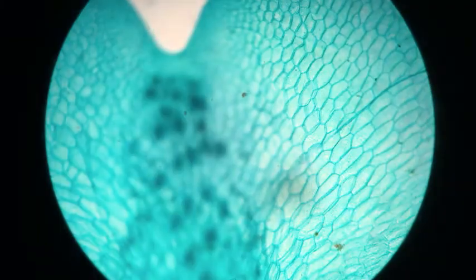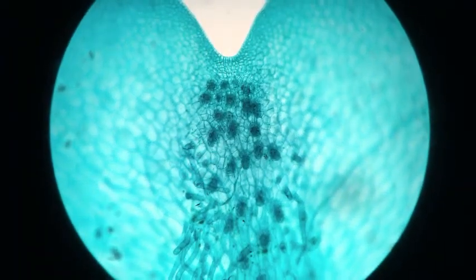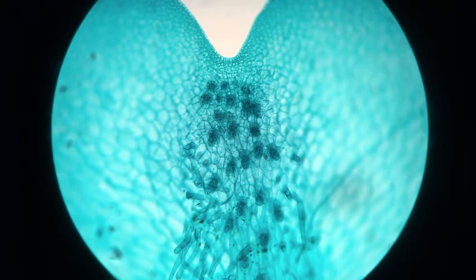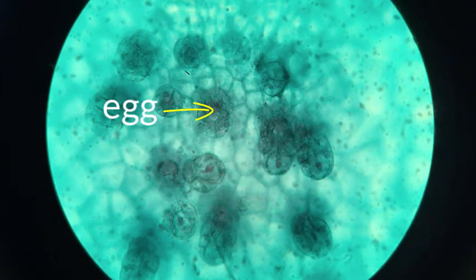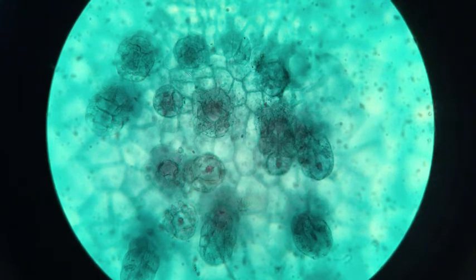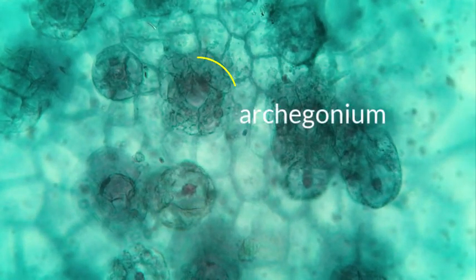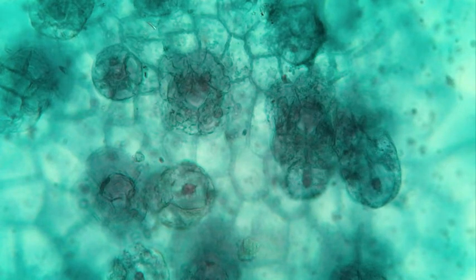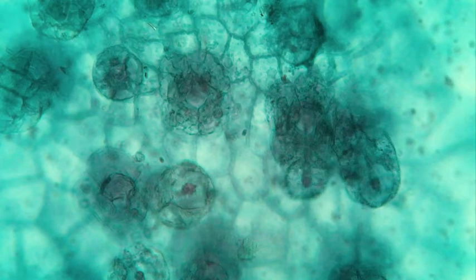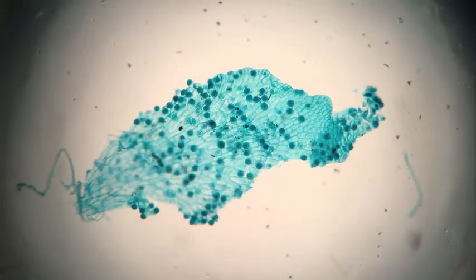When you zoom in on the dark spots you can actually see the difference. Not only are the antheridia more numerous, but the number of sperm cells contained in each anthridium is larger—in the dozens—while archegonia each have a central egg cell surrounded by other cells. Most ferns are homosporous, meaning 'same spores.' If a fern is also dioecious as gametophytes, the sex of the gametophyte is not predetermined by the spore—each spore is identical and able to become either a female prothallium with only archegonia or a male prothallium with only antheridia.